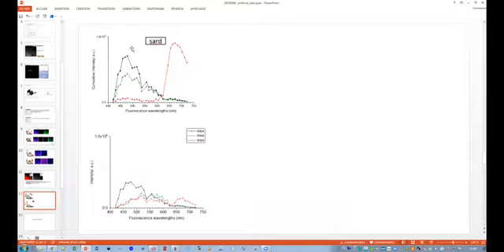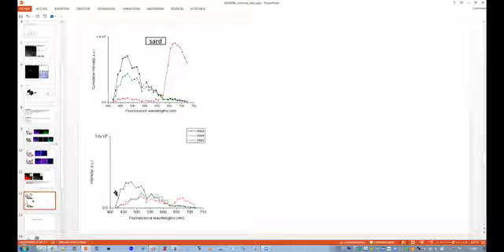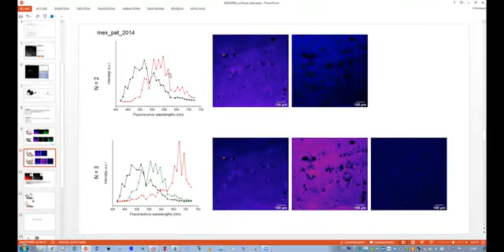What I noticed is that for my first and my second compound, the spectrum seems to be similar, but the green spectrum is lower intensity, though it seems to have the same shape. So maybe it's not relevant to pick three components. By comparison, I performed this analysis on microbial mats from Mexico, with 2 and 3 compounds. And I think that maybe the third component was not relevant.